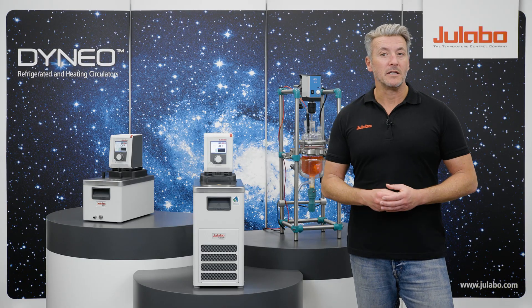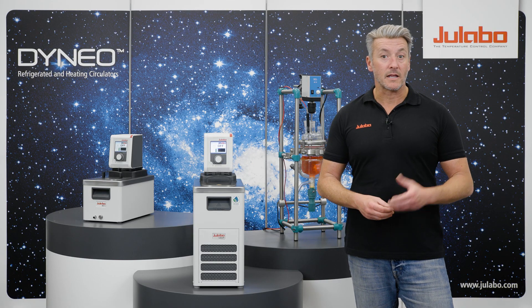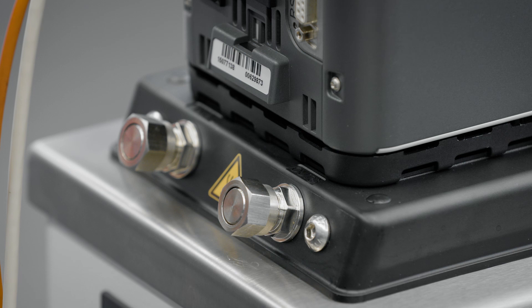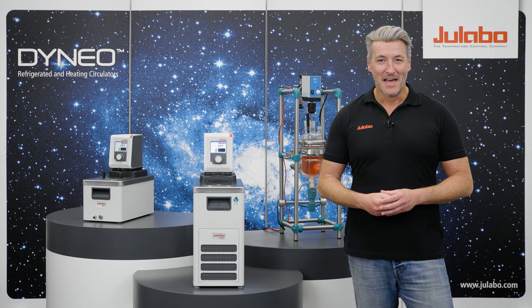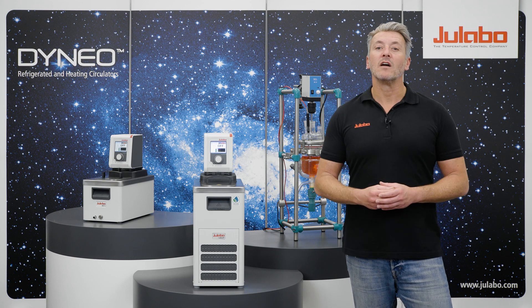On the back of the Dyneu you will find two connections that are closed with a collar nut. One is labelled output, the other is labelled input. Both indicate the flow direction of the fluid.